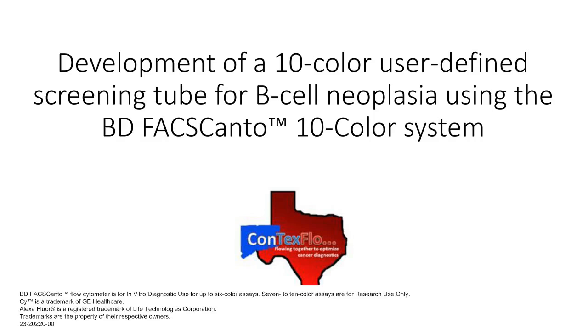So we have Ahmad asking, did you use cells or beads to establish target channels and your compensation? So for target channels, we use beads from BD, actually. For compensation, however, we do use cells. Particularly in some of the violet fluors, we get better compensation results using cells rather than beads.